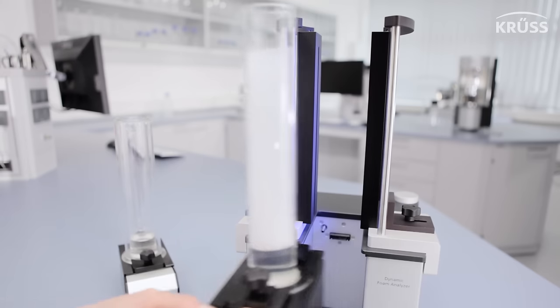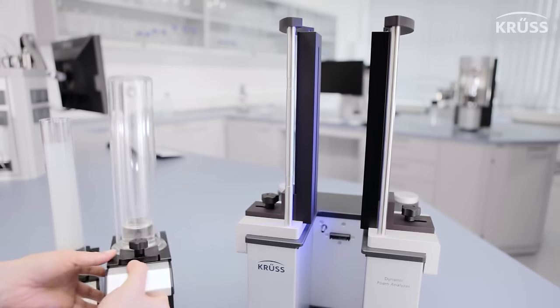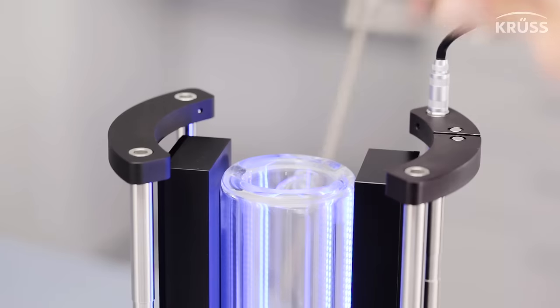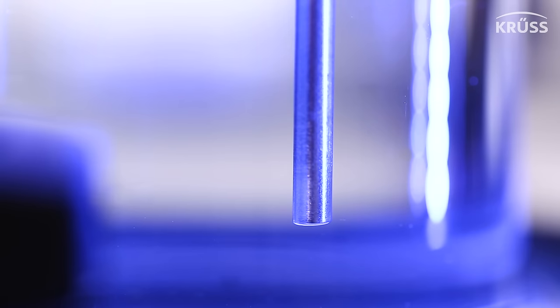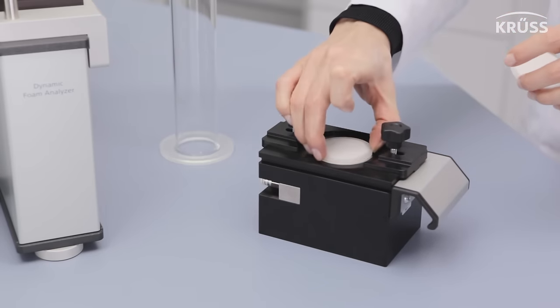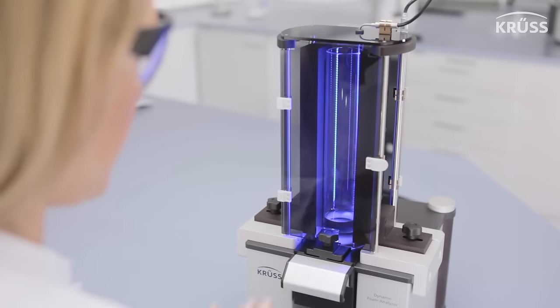The DFA 100 is designed as a modular instrument with many accessories available, like double-walled columns which allow temperature control monitored by a sensor placed directly in the foam, numerous filter plates to control the initial bubble size, a light protection set to block external light, and many more.